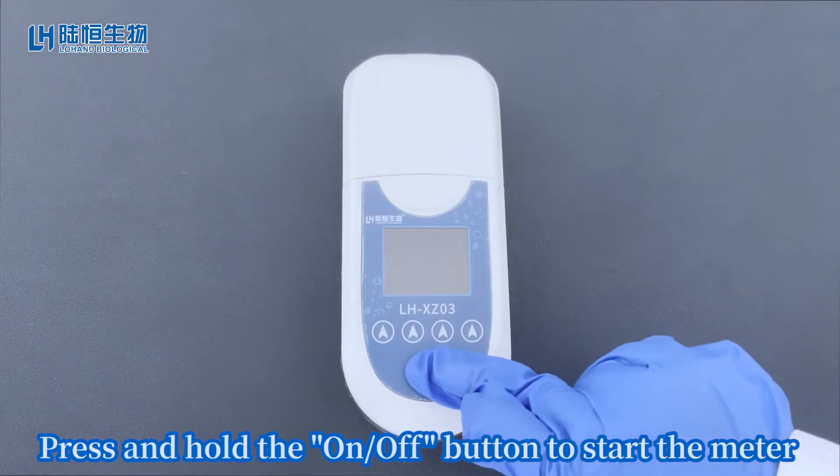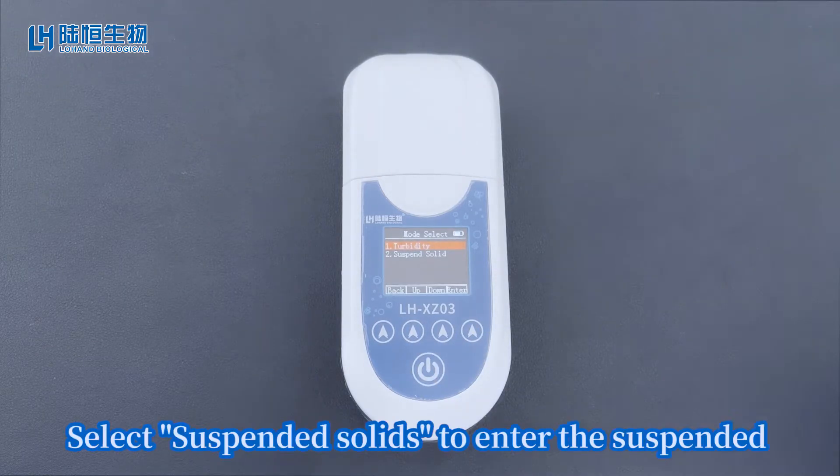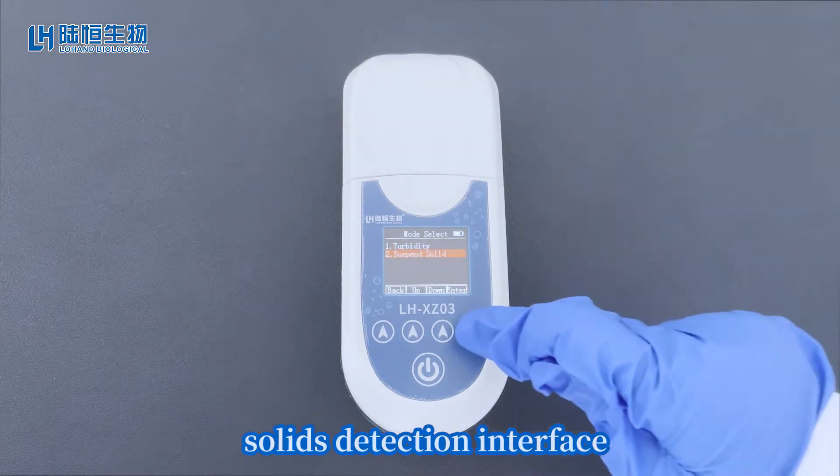Press and hold the on-off button to start the meter. Select suspended solids to enter the suspended solids detection interface.